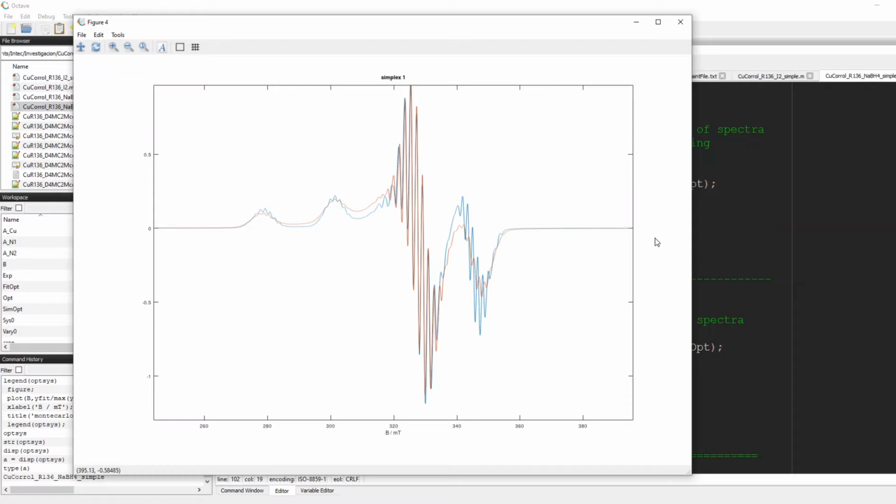Once again, I want to thank the creators of EasySpin. All I did was basically disable some warnings and delete some parts in the EasySpin source files, and it kind of worked. It works quite well in Octave, which is surprising because Octave is not 100% compatible with Matlab. But there are still some issues that I will fix over time.